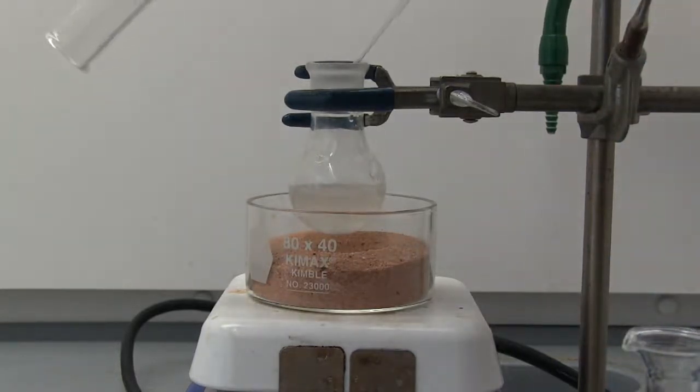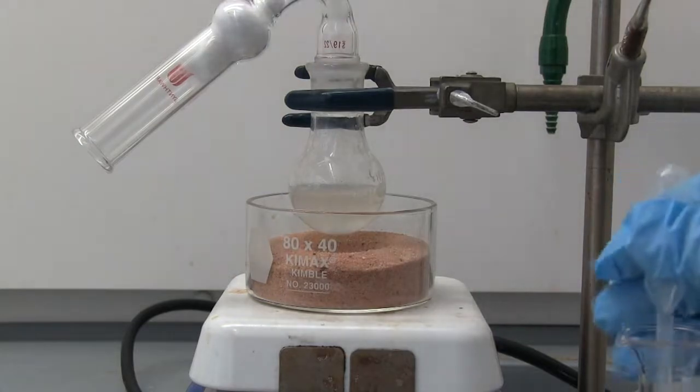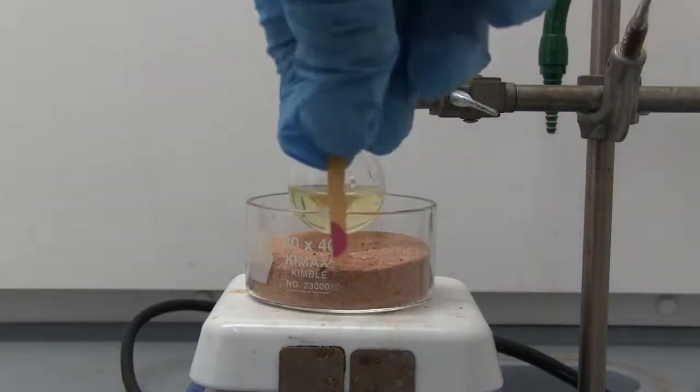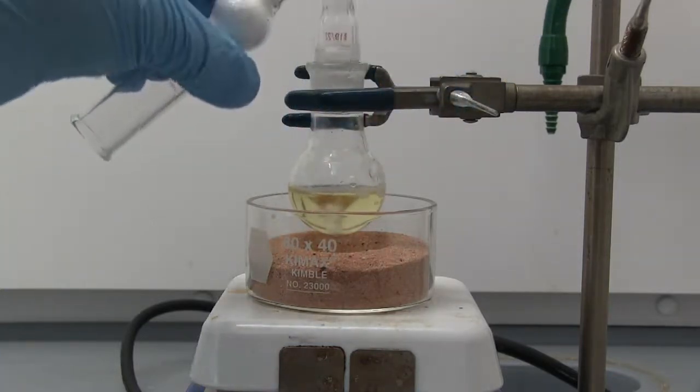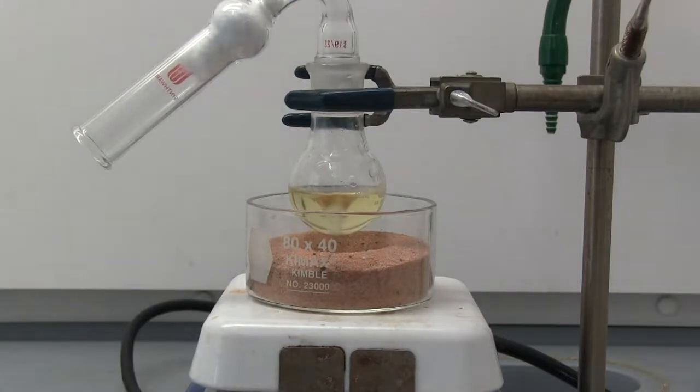Next, we'll get a piece of pH paper to test to make sure we're at an acidic solution. All right, so we've got a purplish-red solution, so we are in acidic conditions. Next, we will extract this.